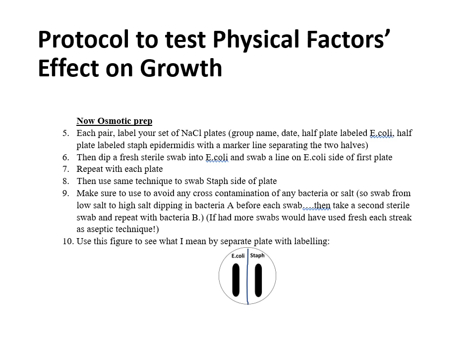Okay, and like we said, any bacteria should be able to grow there unless it's an obligate halophile, but most regular bacteria grow at those low percentages. And then we have plates where we added extra salt into the agar. So those would be, for instance, 5%, 10%, or even 15 or 20% salt.